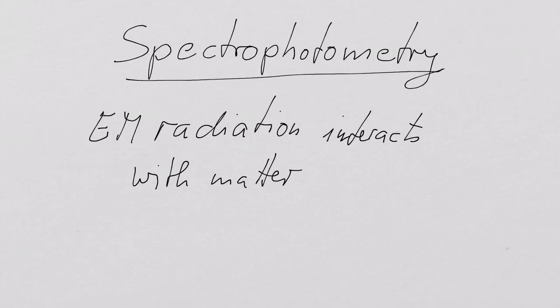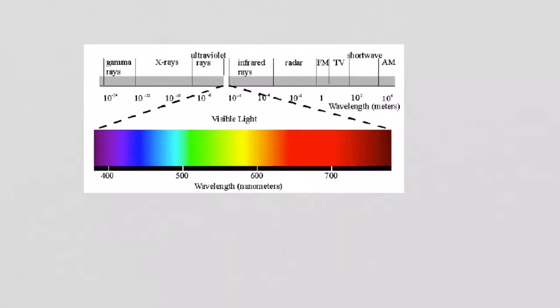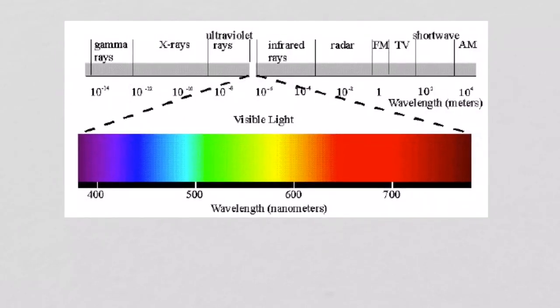And obviously we know a lot of different forms of electromagnetic radiation. Just to give you a flavor of that, what we used in the practical the week before last was basically visible light, and also we used UV light.